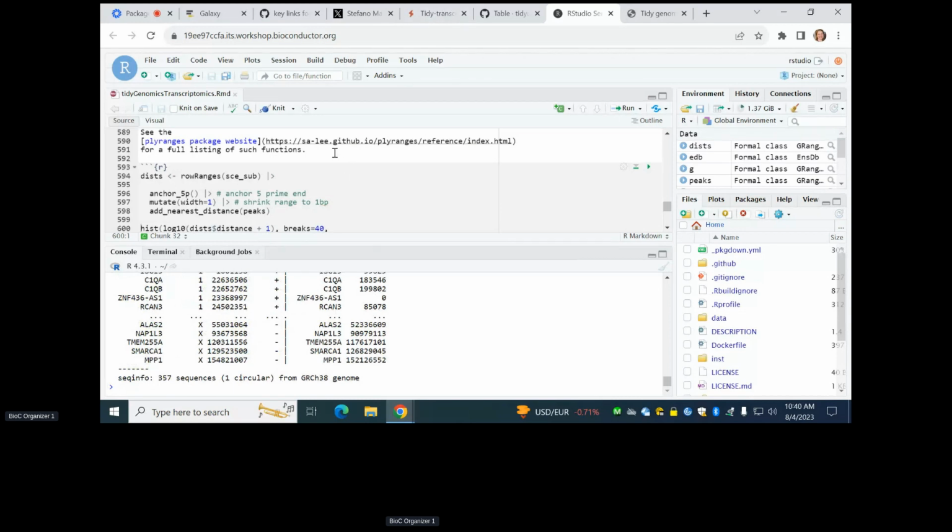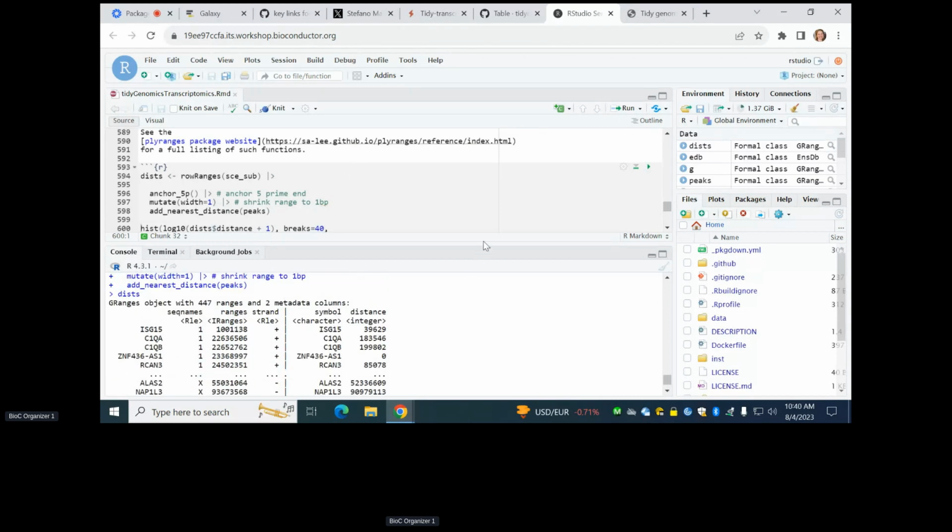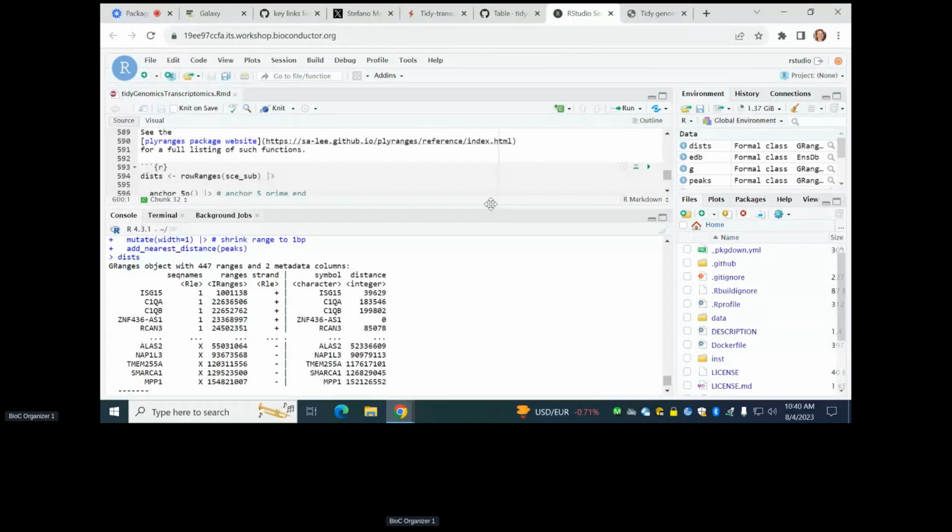So the anchor is a little bit like group by, where it applies to everything until you change the anchor. Yeah, it's like in the background now, these are anchored ranges. They're still GRanges. You could still operate on them. Is that like a subclass? It's not a subclass. It's modifying the way in which, or I don't know, maybe I should ask Mike Lawrence if it's a subclass. It's just modifying the way that future apply ranges operations will work, not the way that they work as GRanges.